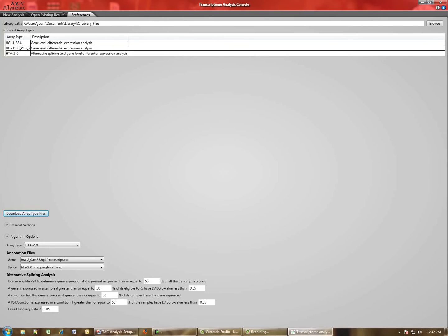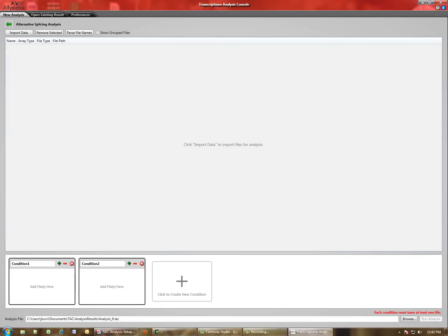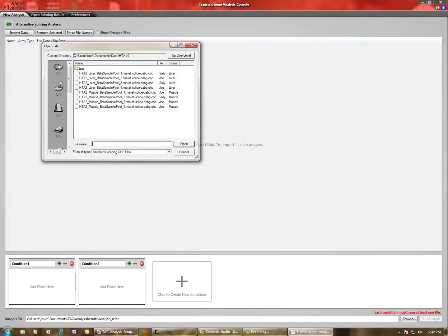Now we'll return how to set up an analysis in the TAC software. So we go back to the New Analysis tab. For this, we'll set up an alternative splicing analysis. We'll click that button. As I said, the same three steps are required for all three types of analyses you can do here. The first is to import your data. So we'll select Import Data.